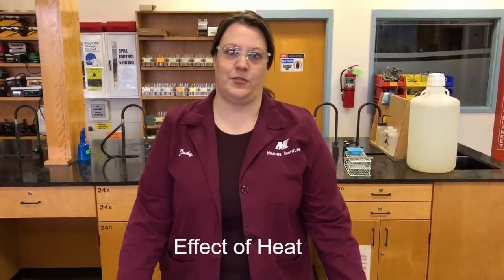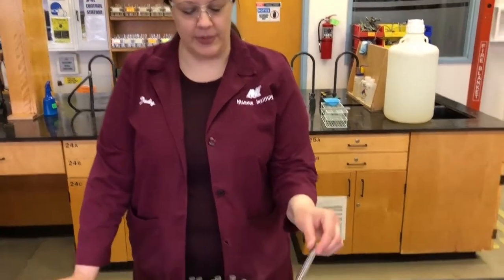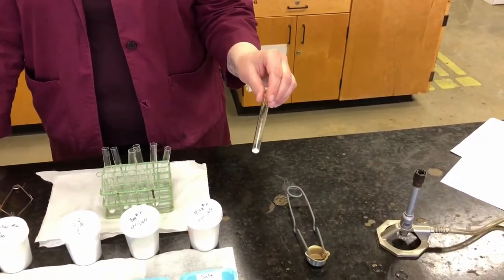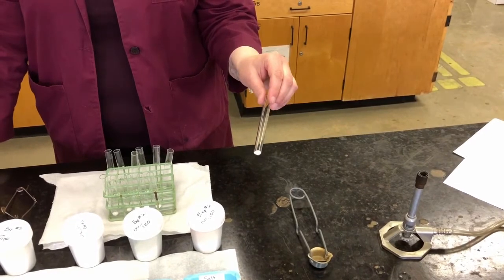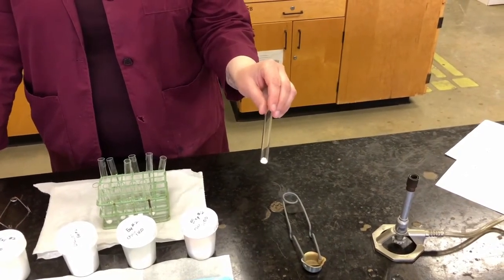The next physical property we're going to look at is the effect of heat. So we're going to take those same 6 samples in test tubes. I already have them distributed out in the small test tubes, just a small amount of the sample. Your textbook or your lab manual says to use about a pea-size amount. So that's about the right amount we want there.